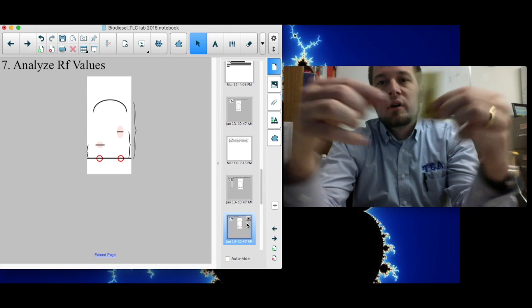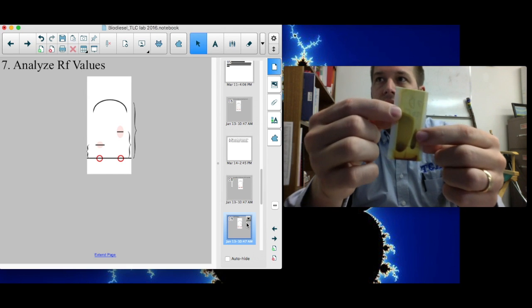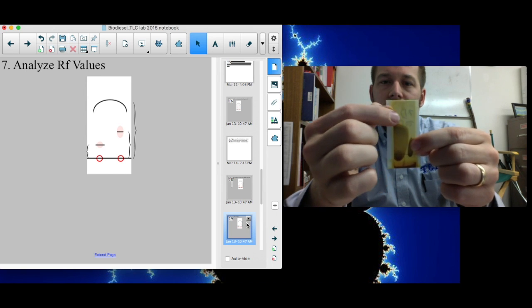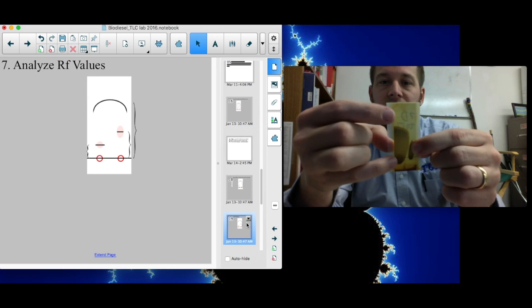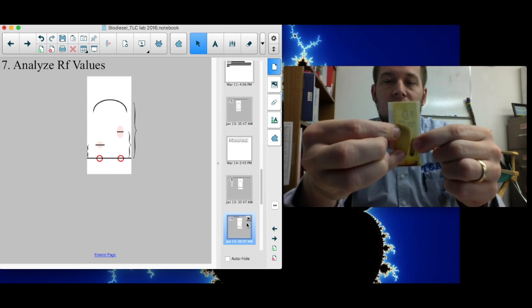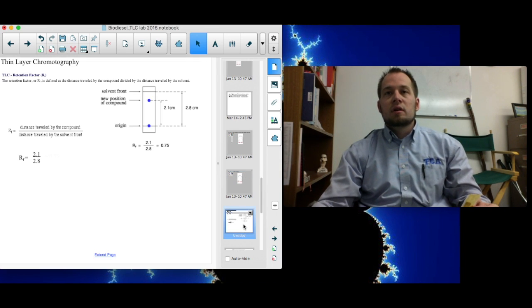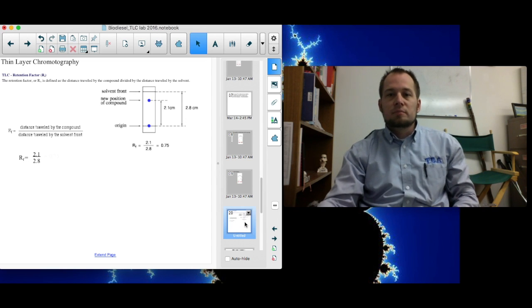Take that number, divide it by the distance to the solvent front. I don't know if you can see it in this. It's a little hard to see. It's like a little pencil line right there where the solvent front went to. So you take that number, that's your denominator, and you take your spot, that's your numerator. Divide the two, and you get an RF value. This kind of shows what it would look like on paper.